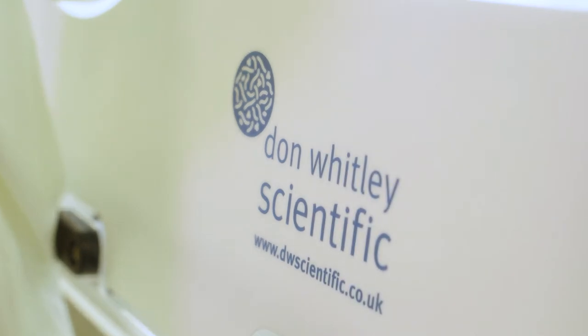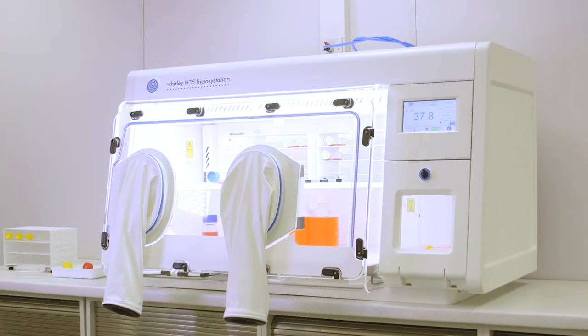One of the things that I actually find very useful about the environment and the workstation is that it's actually big enough to be able to stay in there, keep your cells growing in there all the time, subculturing them as you need to, but also I do my experiments in there.